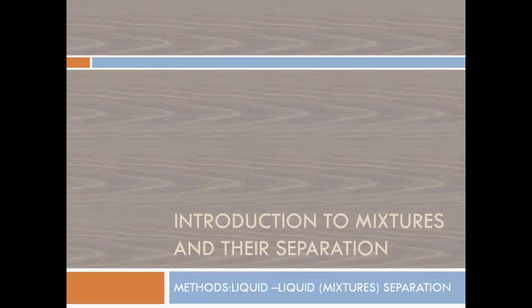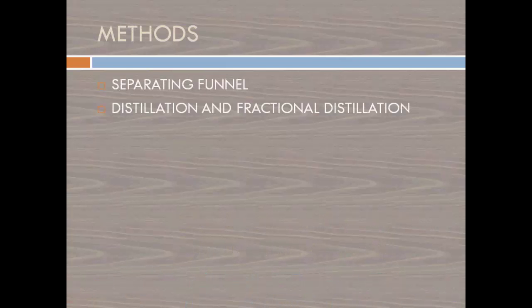Friends, today we are going to start with the third section of Introduction to Mixtures and the Separation, with the topic Liquid-Liquid Mixture Separation, where we are going to learn two methods to separate liquid-liquid mixtures. First is the separating funnel, second is distillation and fractional distillation method. So friends, let's start one by one.